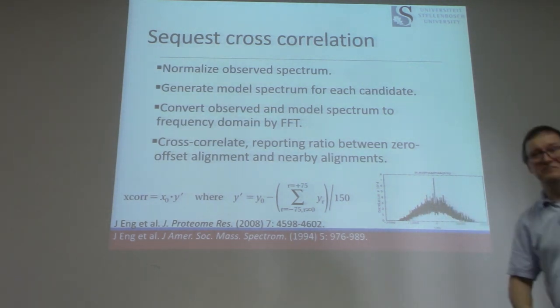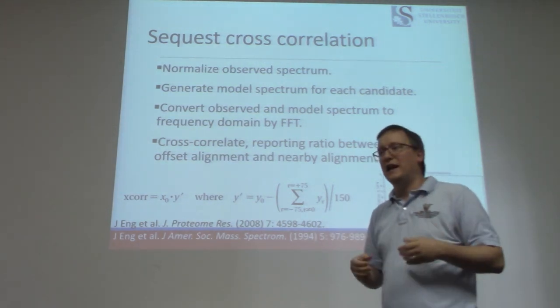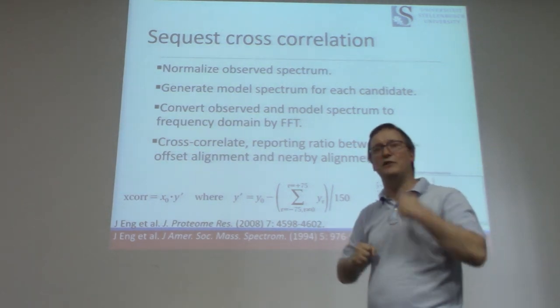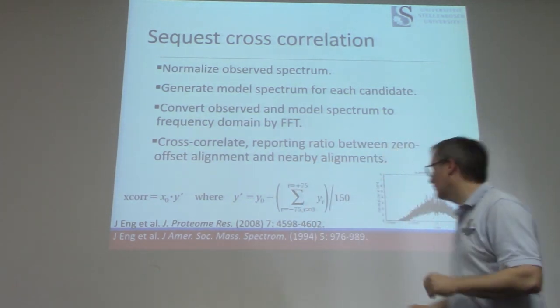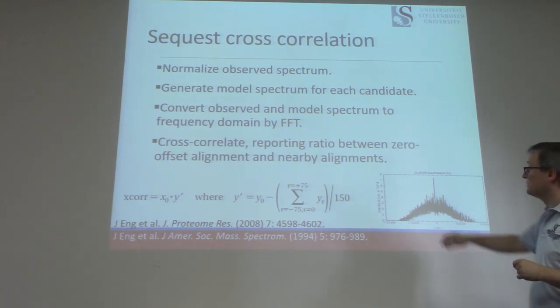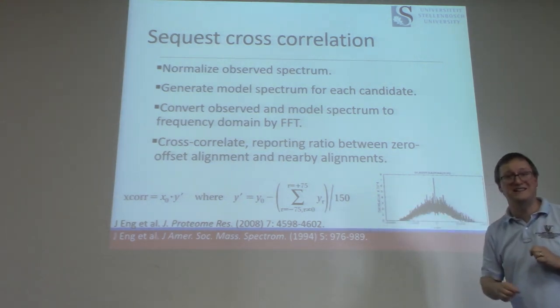That's one way to do it. It's nice because it's kind of resistant to noise matches and helps you to get a sense of how the score stands out against some sort of background matching behavior. That algorithm has been used since 1994. Now, you see this other paper here in 2008?